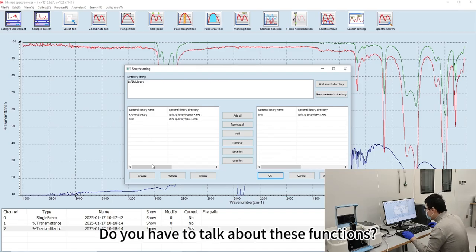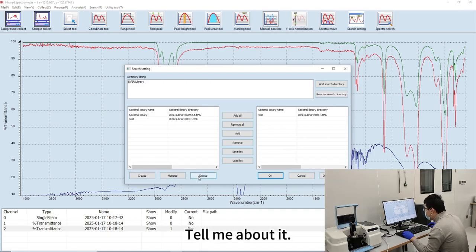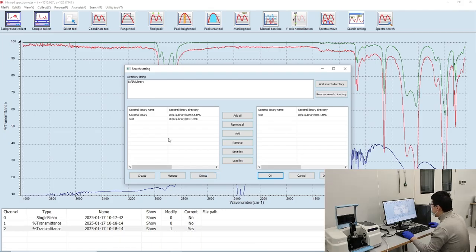Do you have to talk about these functions? Tell me about it, and I'll tell you a little bit about that. I'm done.